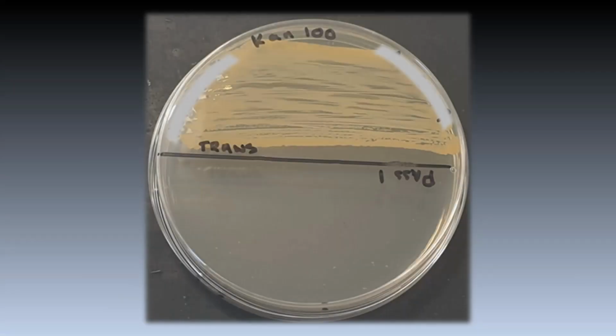Here you can see the wild-type, as well as the transformed isolate. The transformant is growing on the top half of the plate. The wild type is on the bottom. This plate contains kanamycin at 100 mg per liter.